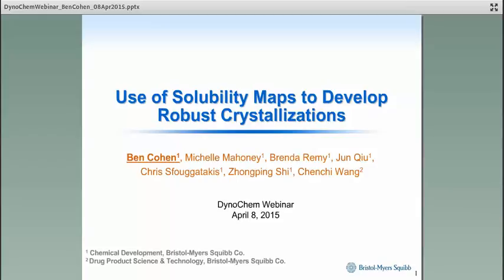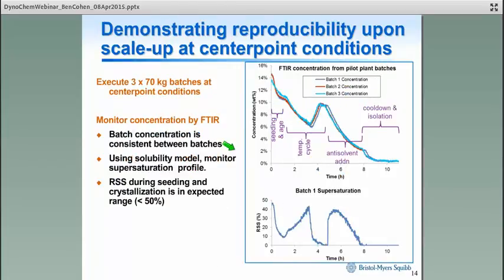So yes, today I'll be talking about the use of solubility maps in the development of robust crystallizations. The presentation will focus on ways of measuring and regressing solubility in multi-component systems. Also, at the end of the webinar, I'll discuss some of the practical aspects of using DynoChem to develop a solubility model in a multi-component mixture.